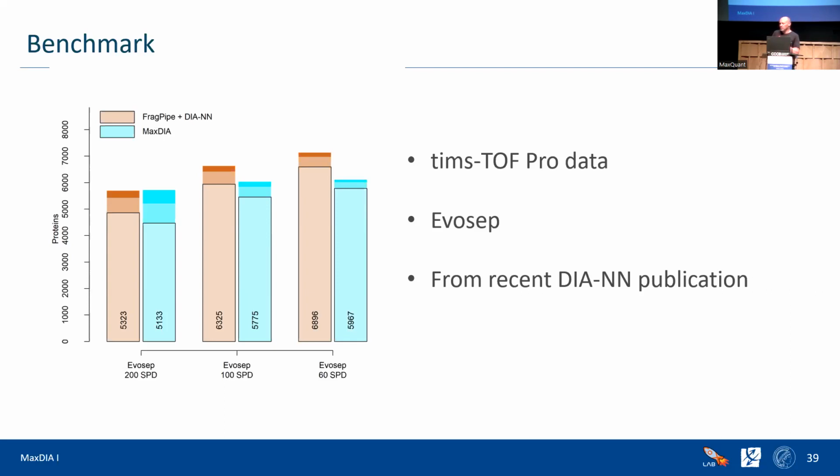And it's not always, so it's not very predictable, because the data flow into the algorithm has to be of a certain kind for the processor to do this. So sometimes, let's say you have 12 logical cores and you set MaxQuant to 6 threads, it can even happen that you see all 12 of them running. And that's not a mistake. That's just how good the chip industry is now.